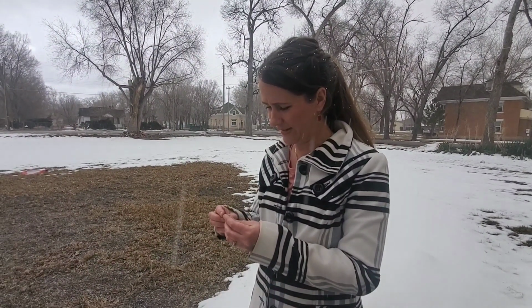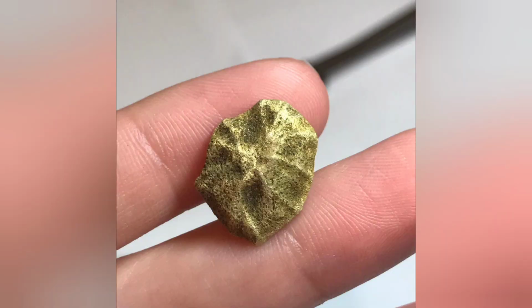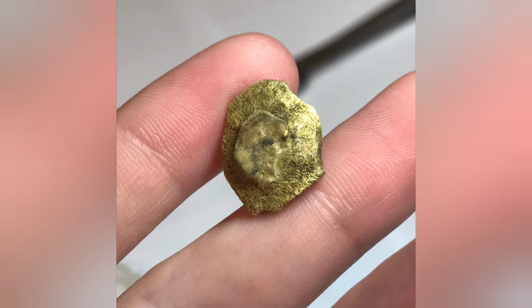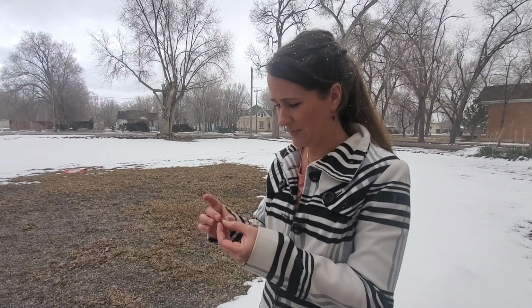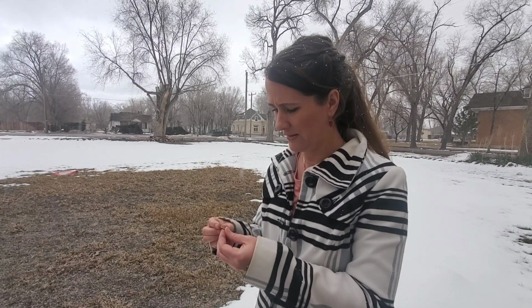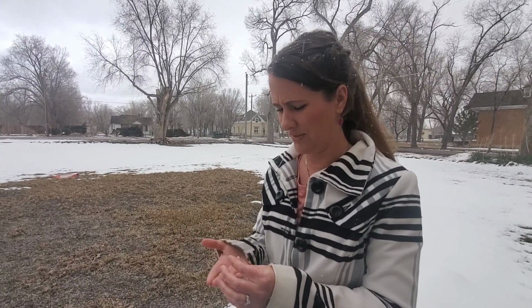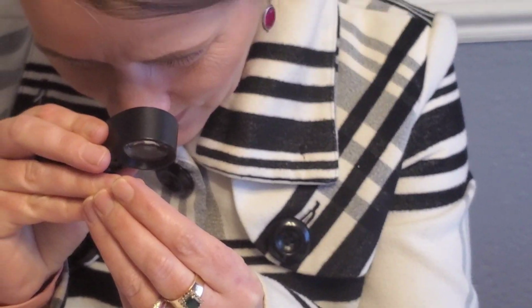So we dissolved it in nitric acid, and that's what was left. It seems rather large for how much it weighs, and it also appears quite porous. So I guess we're going to do another specific gravity test on it, and then maybe I could do a little streak test. That is odd. It's pretty. That's so weird.